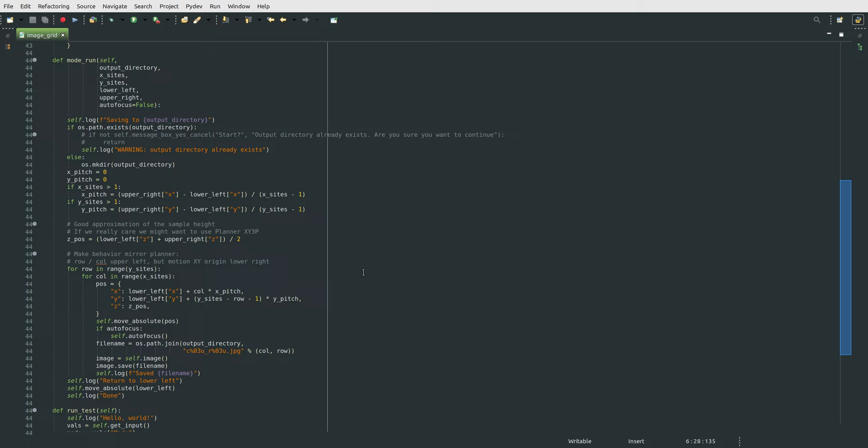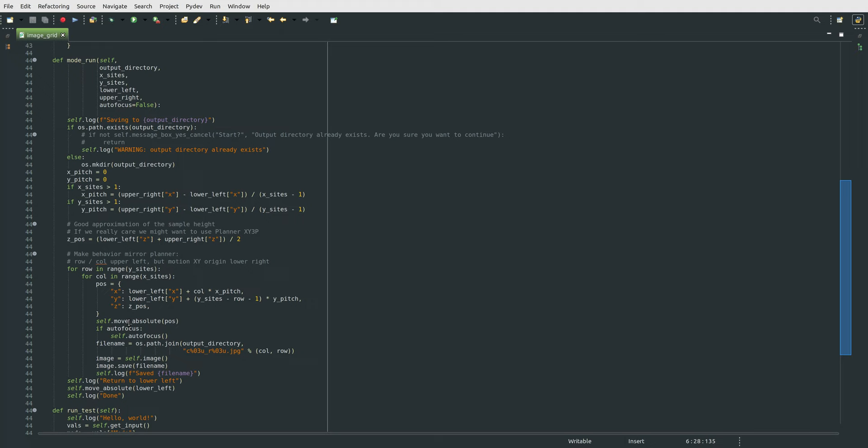and calculates each of the site positions by taking these base x and y coordinates from the lower left, because in these sort of CNC systems, the lower left is the origin of the machine, and adds to each of the x and the y an offset, which is basically the pitch times the number of sites that we've moved over. It then takes that computed position and moves to it. We optionally will autofocus onto that location and snap a picture and save it to the file name here.